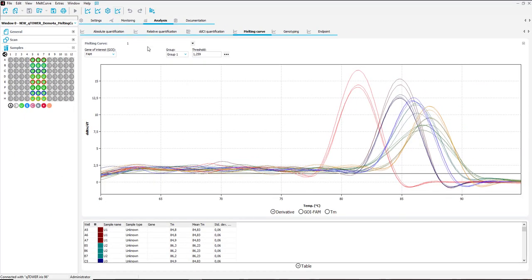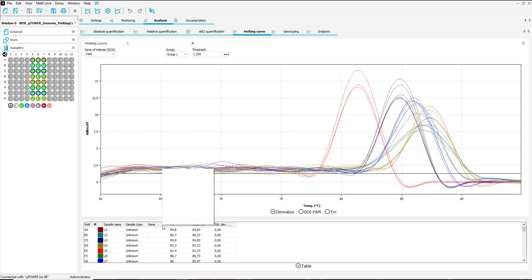Below the graph a variety of results are shown including the melting temperature and the standard deviation. You can also right click on the header to add or remove analysis results information.